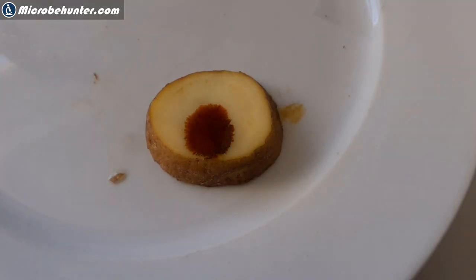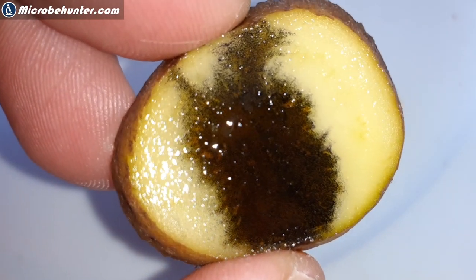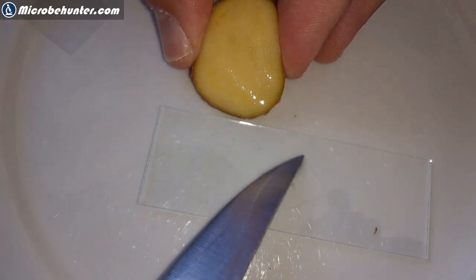Let's try now the potatoes. Those starch grains look even nicer — again a little test and it stains much darker, much quicker. Evidently the concentration of these potato starch grains is much higher. Again under my stereo microscope, here we can see those small little dots, and we'll also look at this now using my compound microscope.